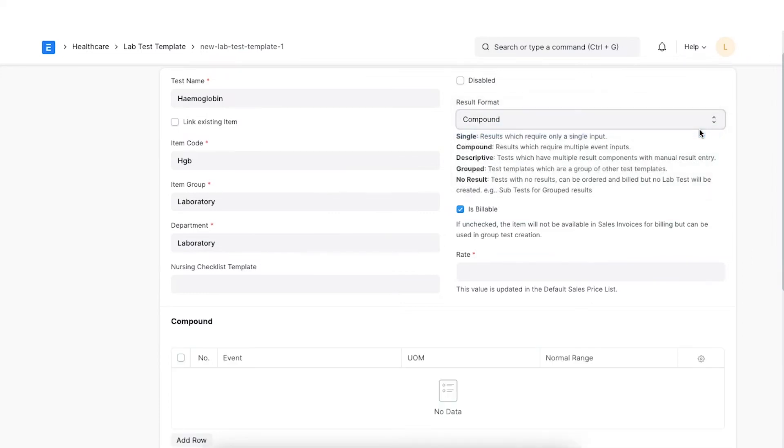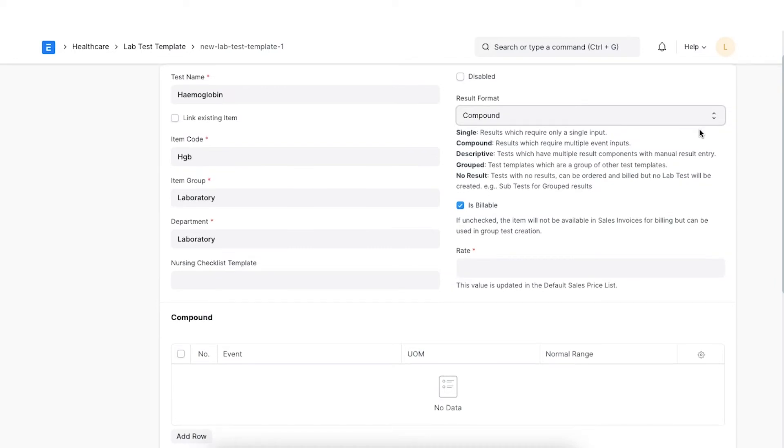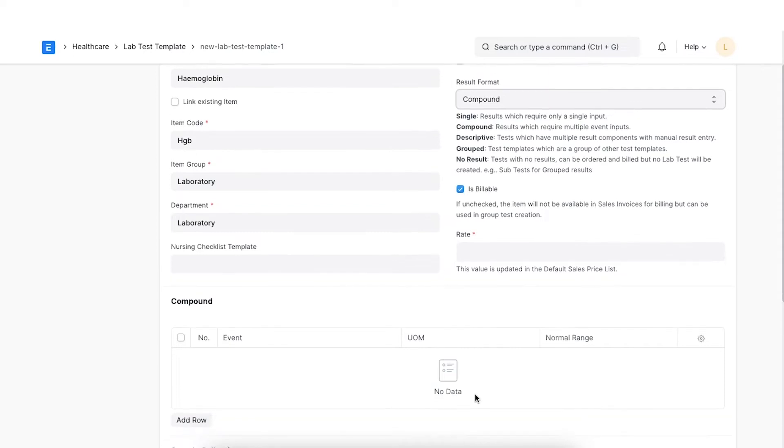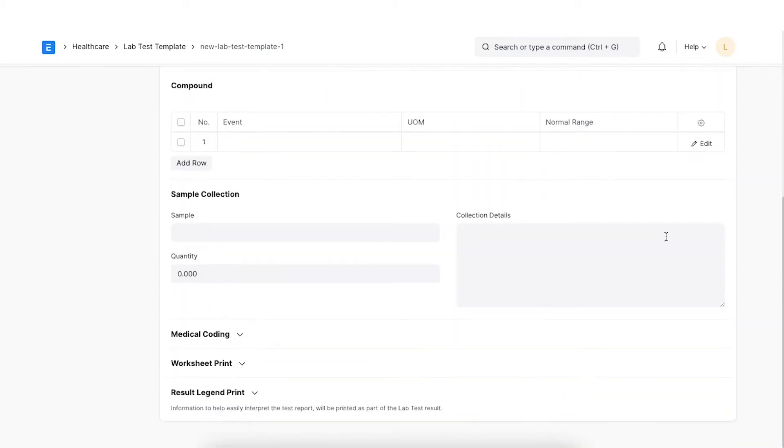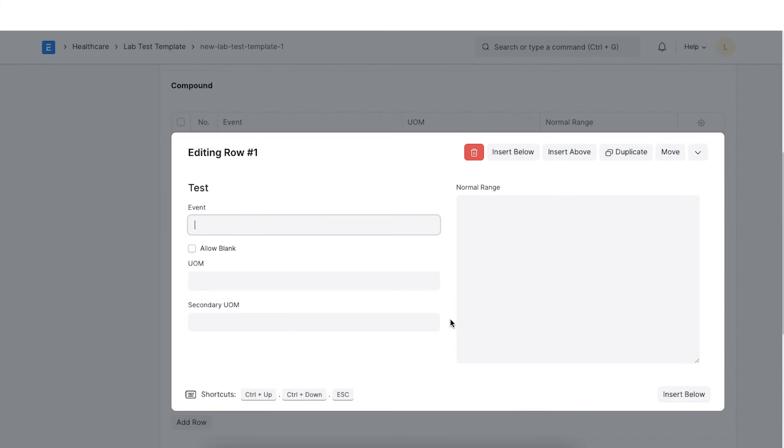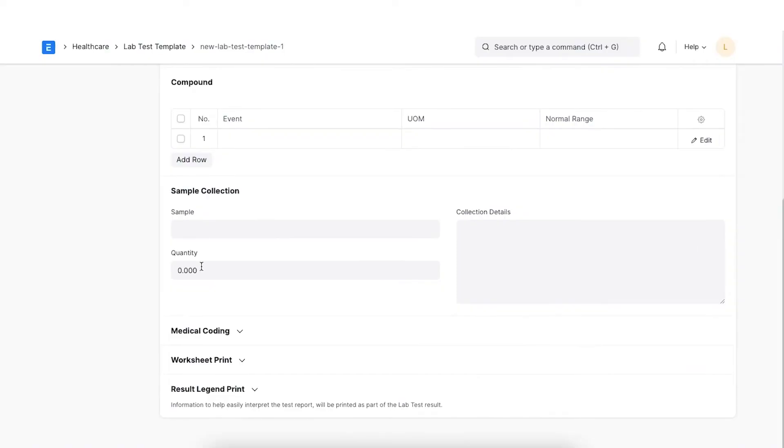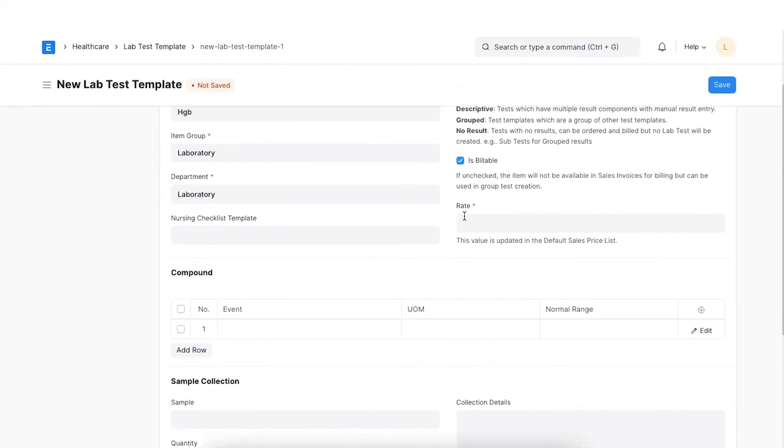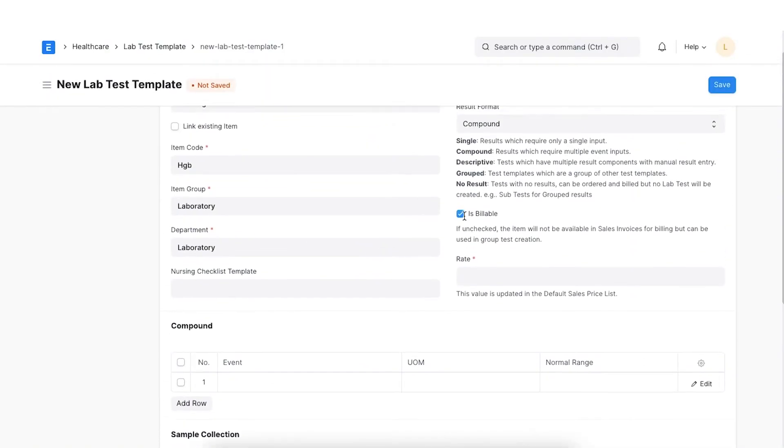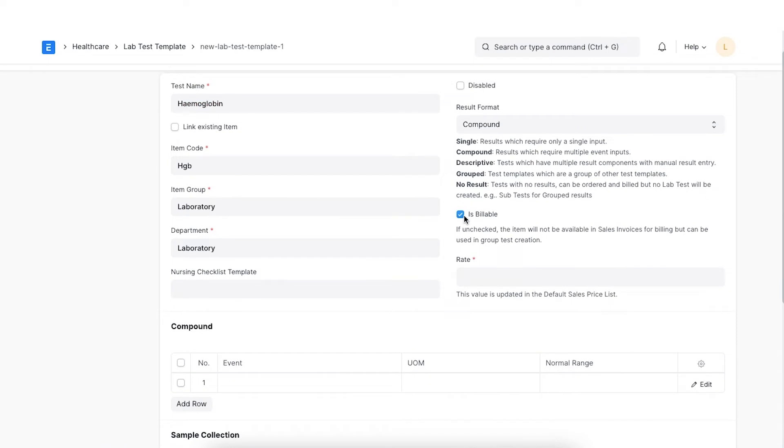Compound. In this result format, the sample is tested for multiple events. These events need to be configured in the compound table. You can set the events and specify the UOM, secondary UOM, conversion factor and normal range for each event. If some event results need not be specified in the lab test, you can check allow blank for that event. If this is not checked, the system will not let you submit the lab test unless all the result values are set. For example, let's take a CBC blood test, where you have multiple measurable components against which standard normal range is specified.